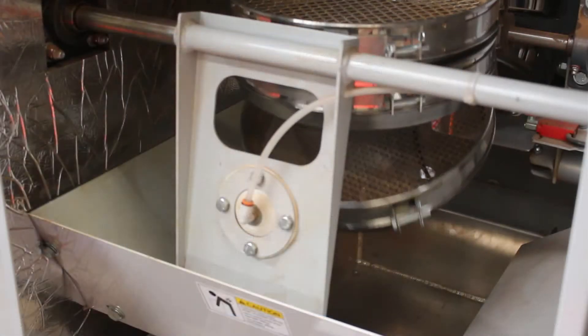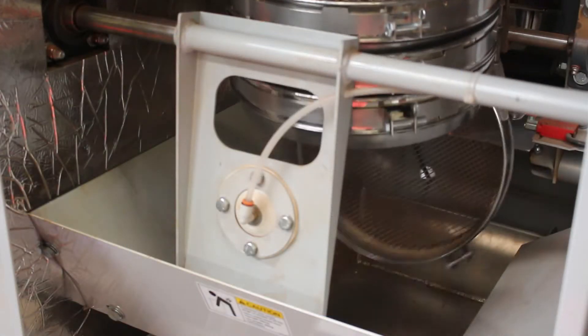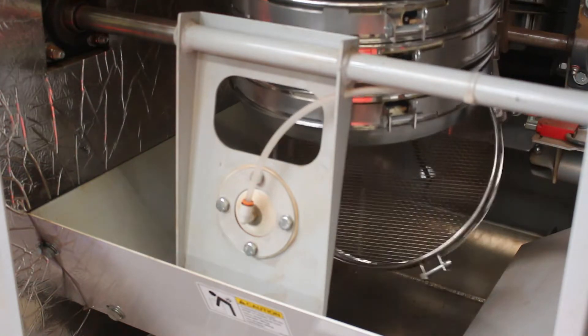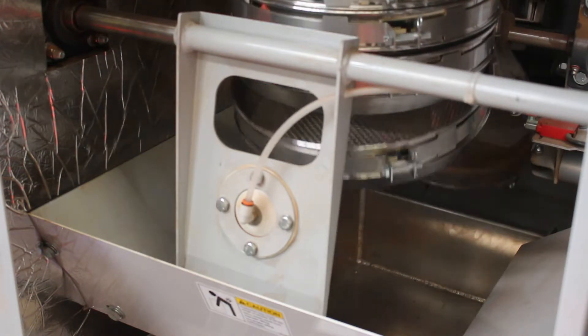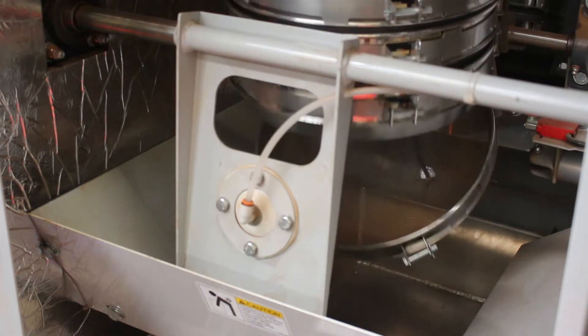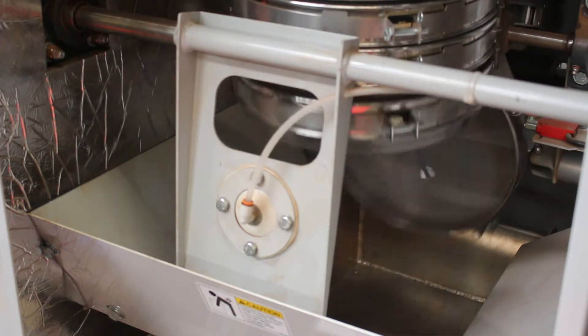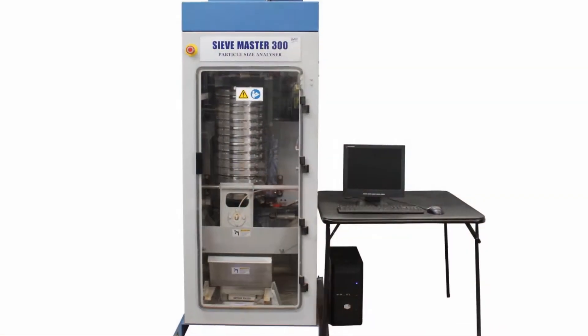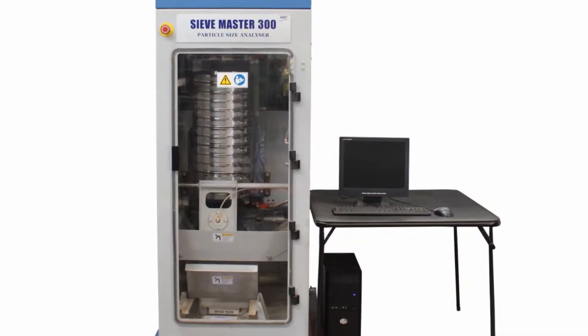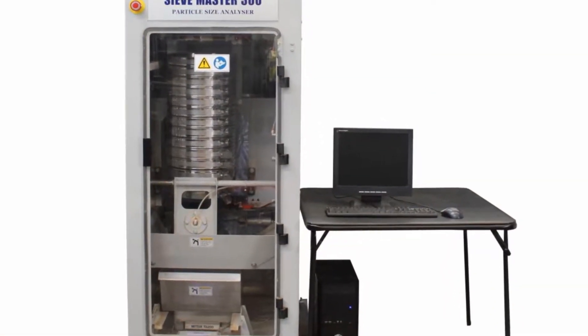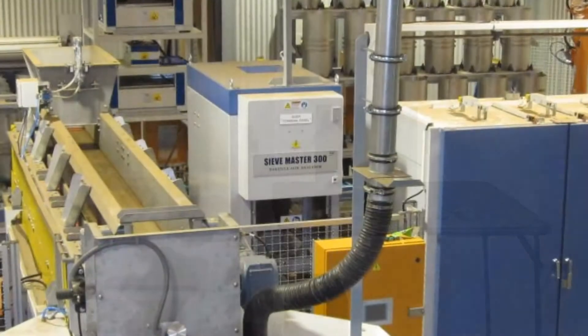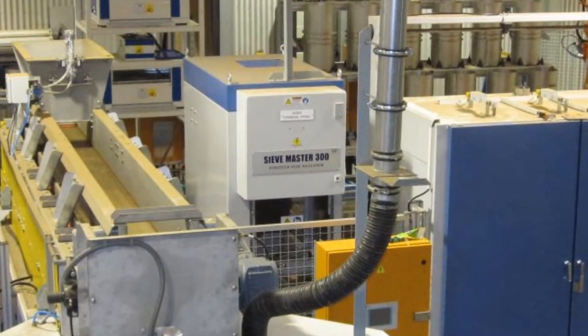The machine is able to accept 12 300mm standard half-height sieves which can be customized to users requirements. The SieveMaster 300 can be used as a standalone machine controlled by a PC or part of an automated system.